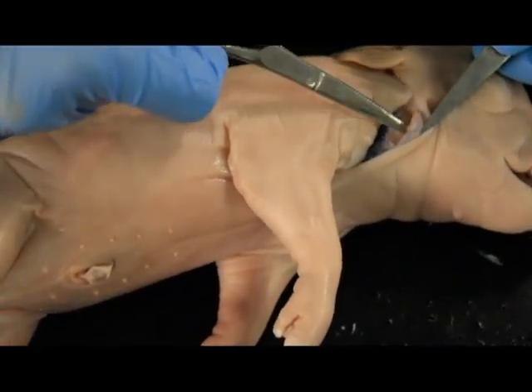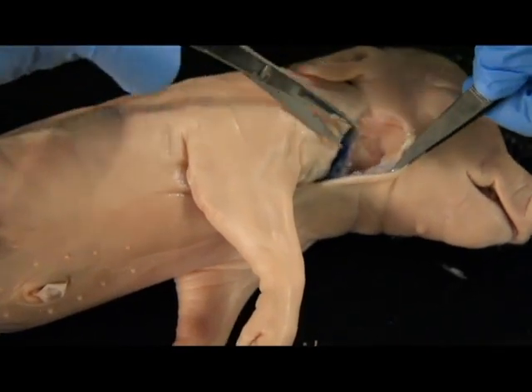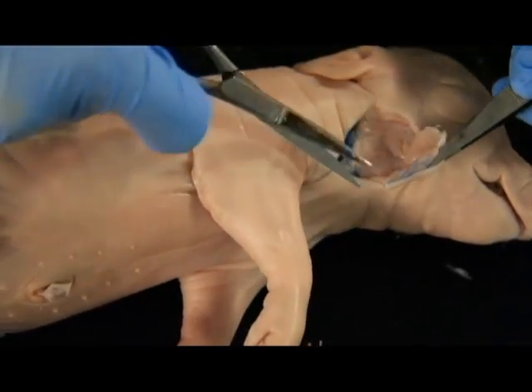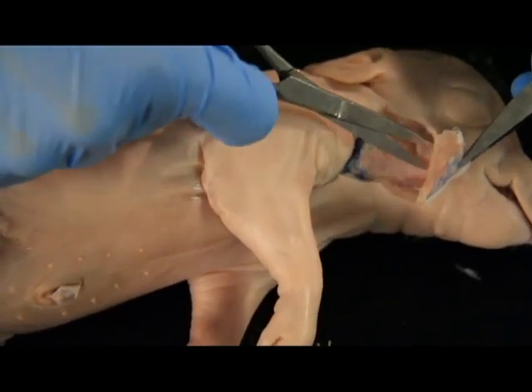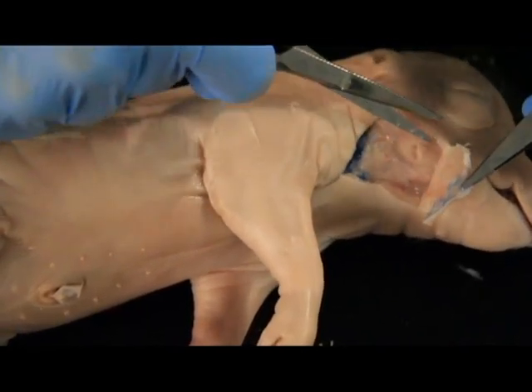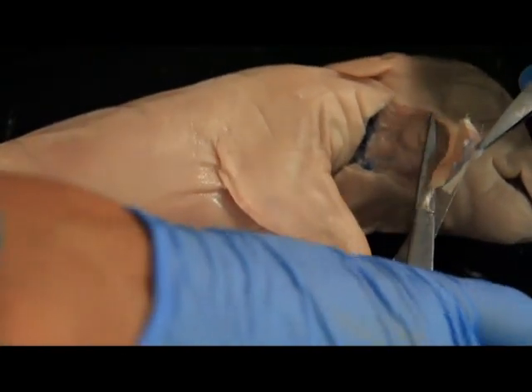And again, you can kind of look in and see that once we just cut this connective tissue, we're really not going very deep, and we're not hurting anything. So you can slowly start to peel this away. Now you want to go very slowly, much slower than I'm going, because there's fragile things here, very shallow, that you don't want to cut away.